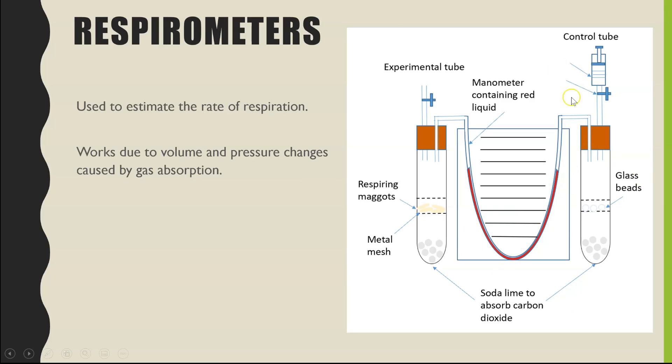So we're going to be looking at the use of a respirometer today. We're going to go through all of the pieces of equipment here, the purpose of each, and then what we'll be measuring. And it's all to do with changes in volume and therefore changes in pressure caused by gases absorbed by whatever living organism is placed inside of this experimental tube.